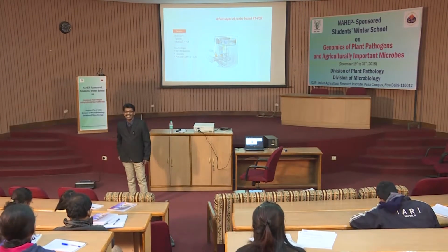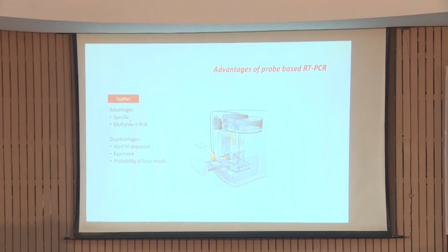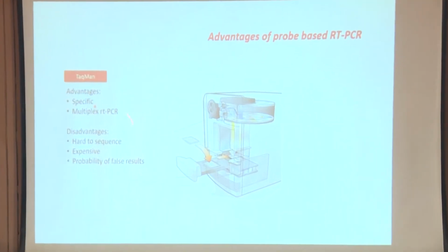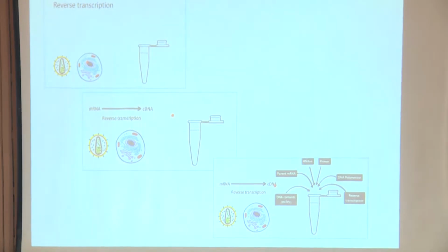Okay. So, you order it, get the probe done, then you set up this. For that reason it is extremely specific, right. And of course, there are some disadvantages. Let us not discuss that here. So, with that, I just conclude the first part of this real time PCR lecture.